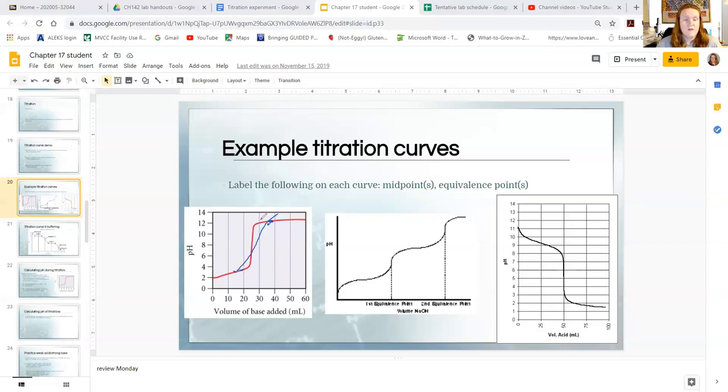When you get up to the top of this curve, so you see it starting to flatten out, you can go back to one milliliter increments, but you want to make sure to go long enough in your titration to get a nice flat plateau at the end. Okay. So that's your first two titrations.